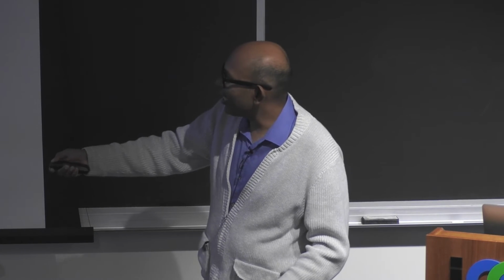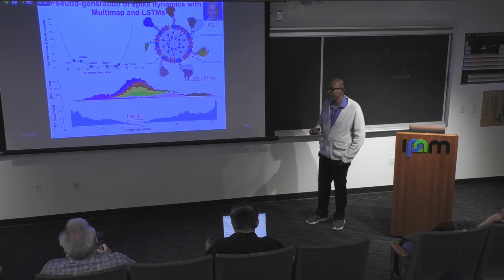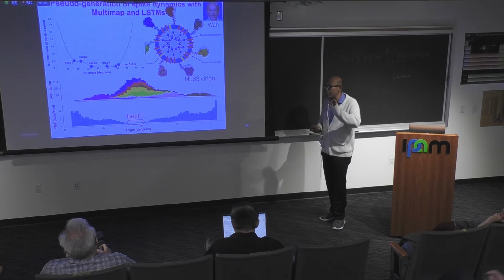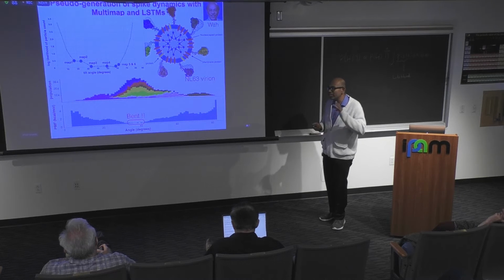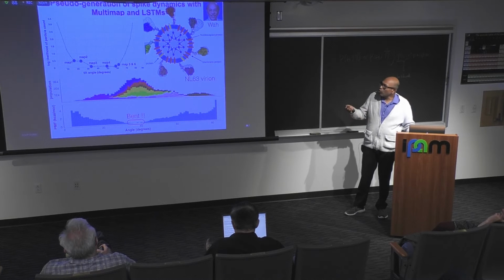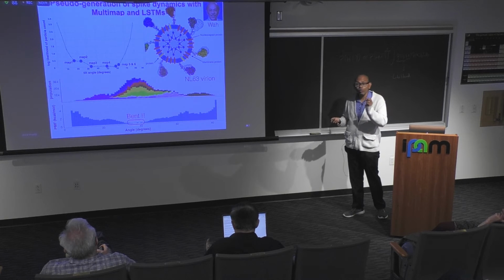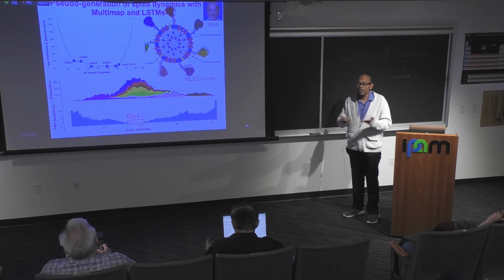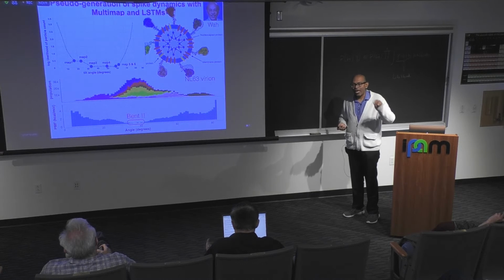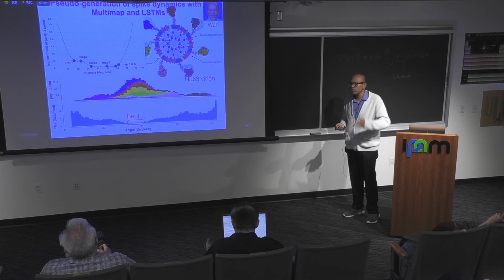But I give my simulation the opportunity of doing it, which is very different from the diffusion map kind of approach that we were talking about. Essentially, we have to learn inferring things rather than imposing things. Okay, so now I have gone to an ensemble, but still I don't know my pathway. An ensemble gives me a bunch of structures of free energy, but on my free energy surface, where I am and what the pathways are, I still don't know that.